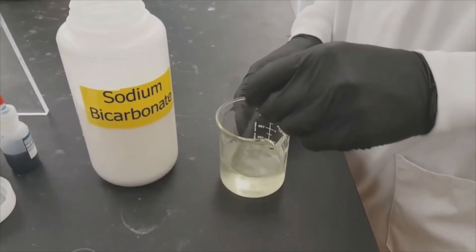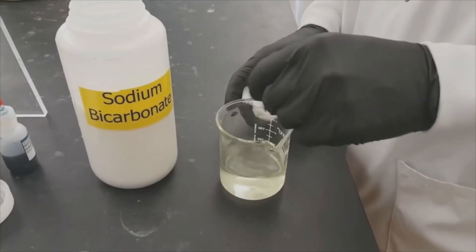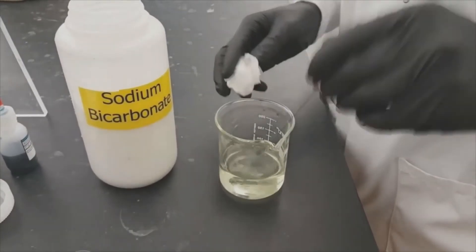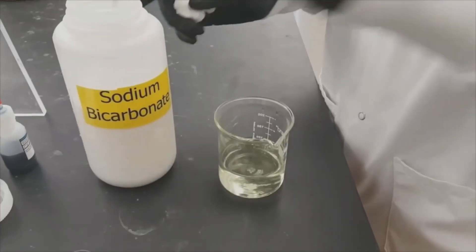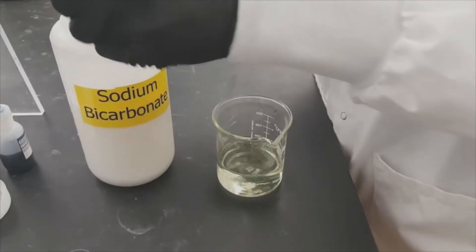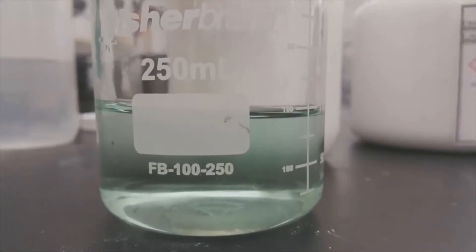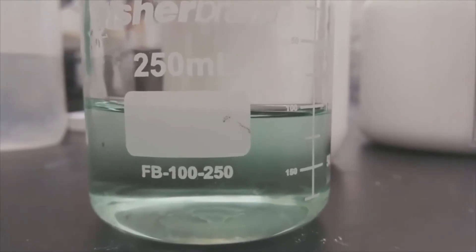This will bubble up and it can overflow if you add too much at one time. So you'll want to add a small amount and then stir it really well and then add a little bit more until it becomes green or until it just barely turns blue. That will tell you that it's been neutralized.